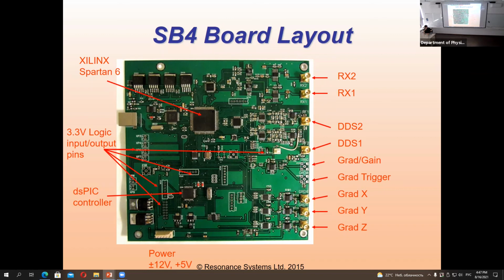It's used by us, and used by our competitors. This is something people live with now. There are guys in America, the company Tecmag in Houston. They have developed their own switch, a really wide range switch. The switch, we call it a duplexer. This duplexer is for quite a narrow frequency band, so that you have these resonance conditions. There are guys who are doing this with PIN diodes, but actually I don't like this solution.